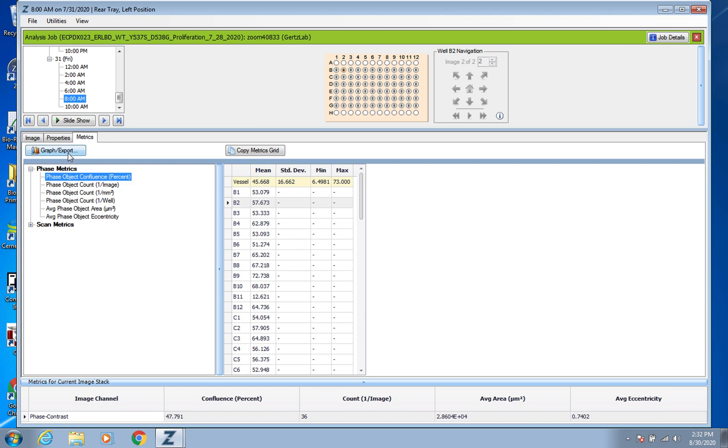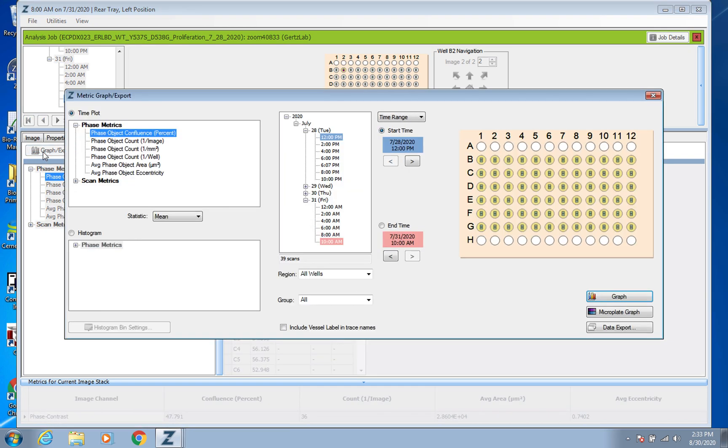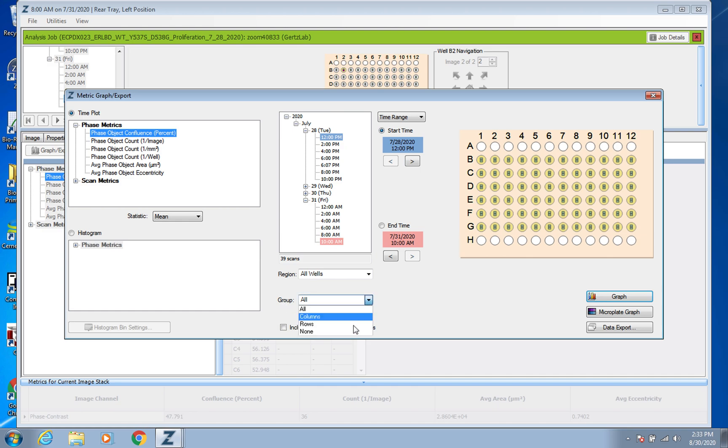And then you can just click on Graph Export. Again it's already clicked on that and now you just pick your time range. Normally it's already selected, normally all your wells are already highlighted.